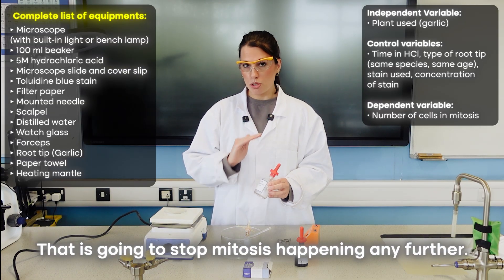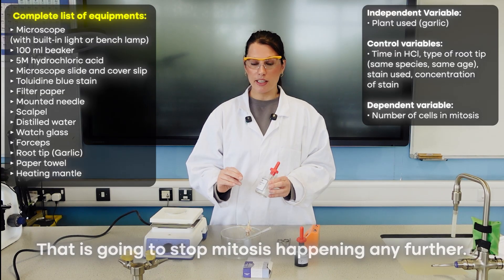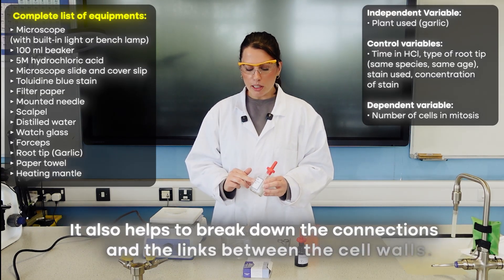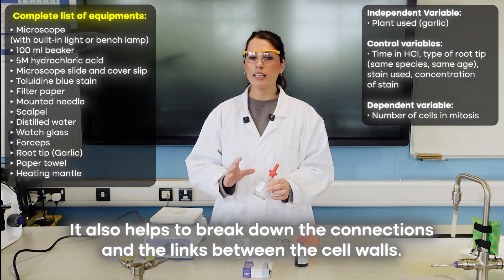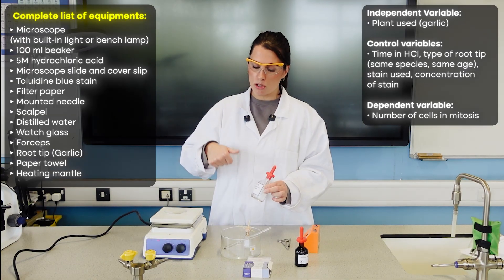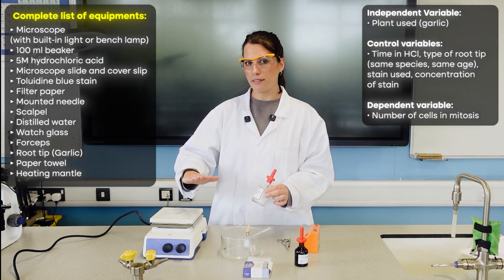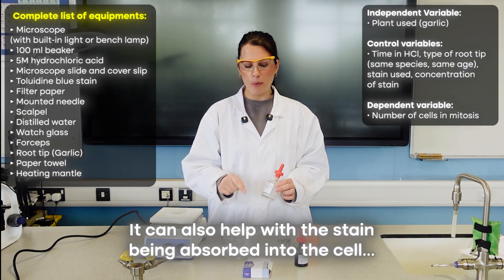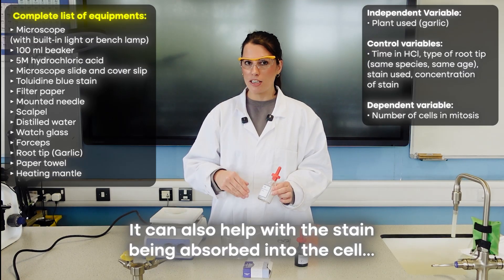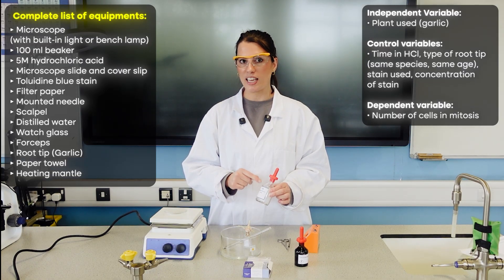It also helps to break down the connections and links between the cell walls so that when we squash it, we get a single layer of cells. And it can also help with the stain being absorbed into the cell and the chromosomes getting stained.